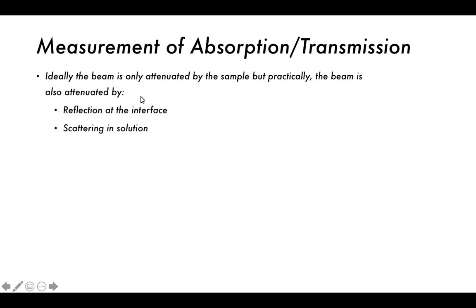Usually there is some reflection. It's better if you do it at 90 degrees, so basically at right angles. So if this is the wall of my thing and my light is coming like this, it's at 90 degrees and kind of a T shape. That's probably the best way, but still, even at that, there is a certain degree of reflection which happens.